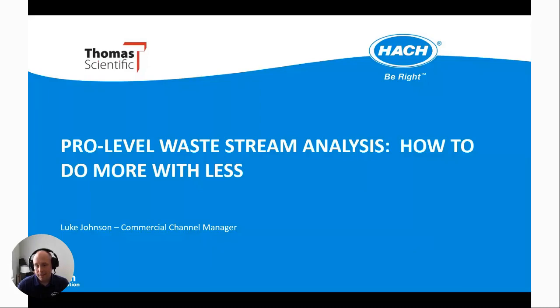I also want to share with you that at the end we're going to be sharing some important application notes that list EPA compliant methods for wastewater analysis.